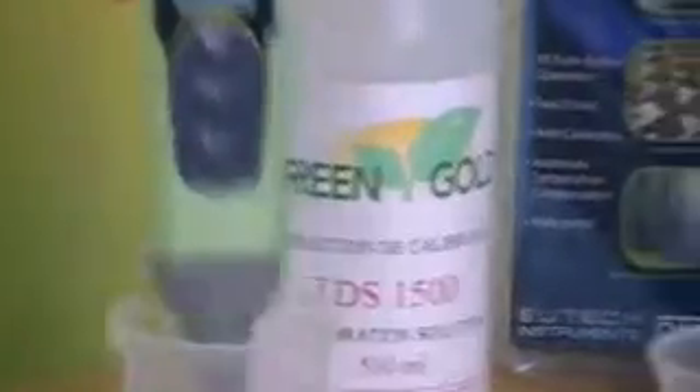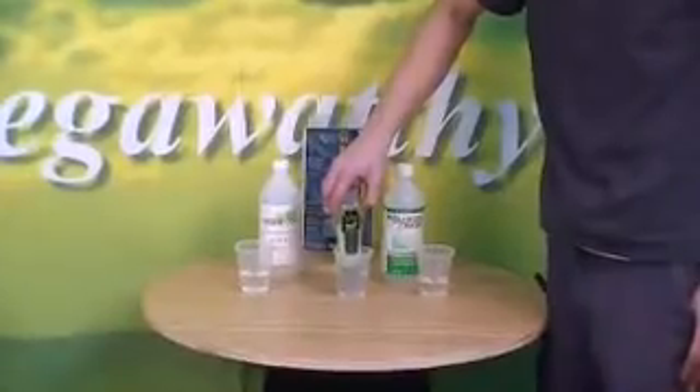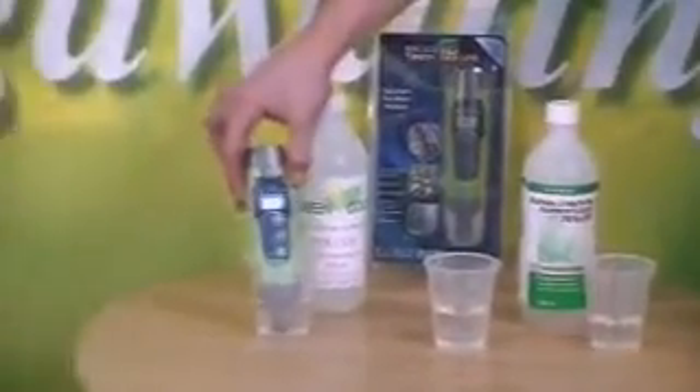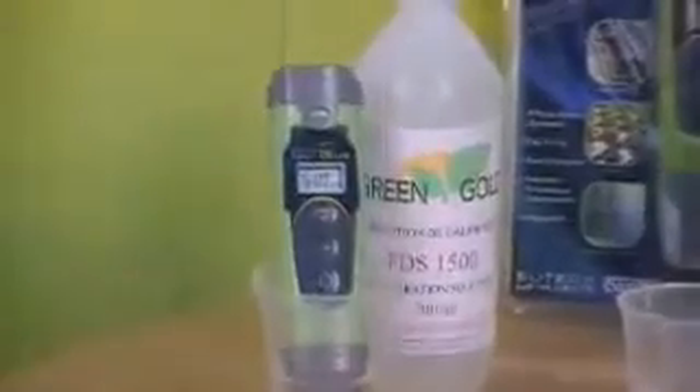After that, to test it, you take it out of your solution and turn it around in your water again so you get all the solution off of the electrode. You shake it off, get the water off, and put it back in your solution 1500, and wait for it to read down to 1500 — it should work.